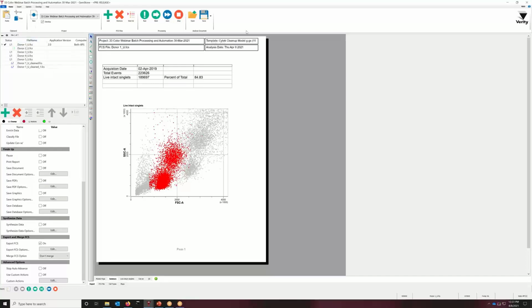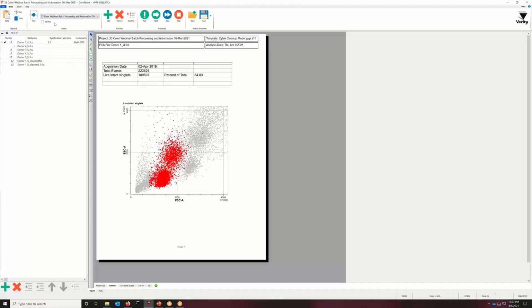If you want to set this up in compliance mode, you need to close the program, set up compliance, set up user groups, and then reopen the program in that compliance mode. And you'll come back to where you were here with just ready to go in your batch system with your batch controls active.